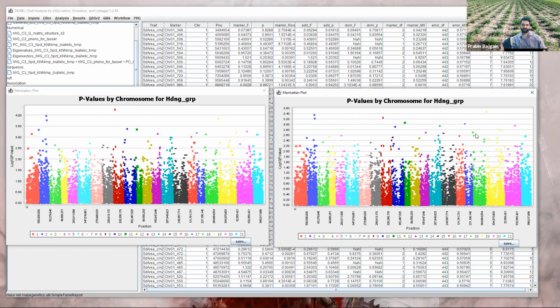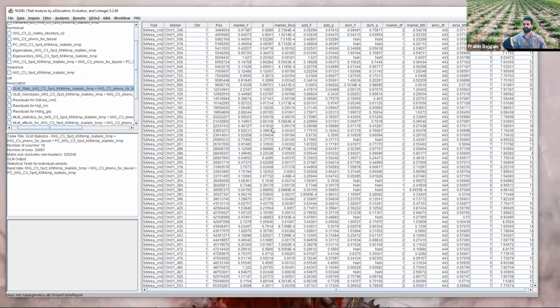If we were to shrink this down a little bit, the markers that are appearing up top here look to be in about the same positions as here. Of course, that's not an indication without knowing the SNP names or the loci names. But again, speaking from experience, I do think that these loci are the same. So despite the heading being a little under the expected line in the QQ plot, I think we have the same loci here. And an easier way to test this, of course, is to go here.